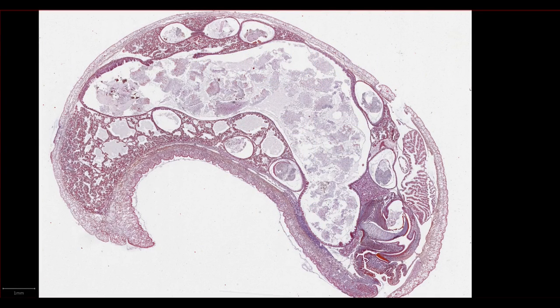Hello, and welcome to Down the Scope. Today, we'll be looking at a section from a snail, concentrating on the general anatomy and organs present in the section. As usual, you can find a digital version of this slide on the website at downthescope.co.uk. There's a direct link in the video description.